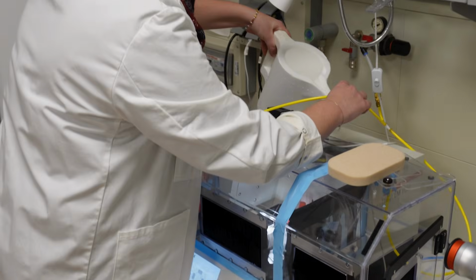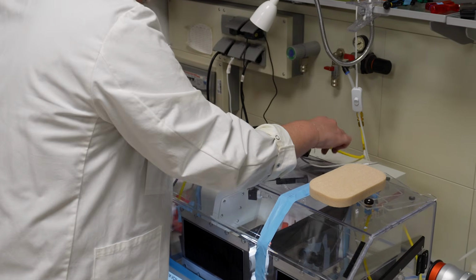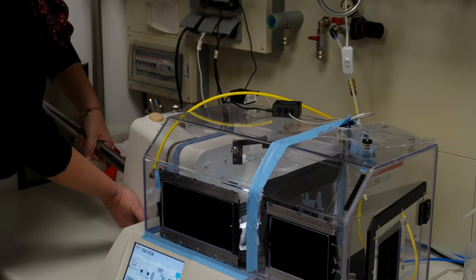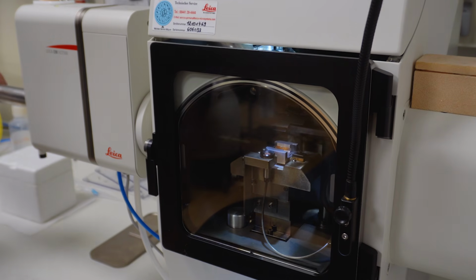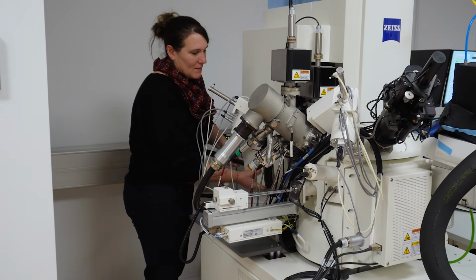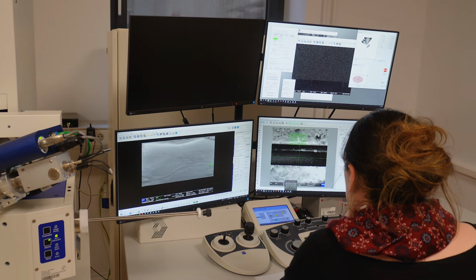In order to investigate the calcium transport logistics, I need to look at the precursors, and those precursors need to be maintained in conditions that are near native. So I need cryogenic workflows. All my images are acquired in cryo mode, which means the contrast is very reduced, and the artifact from the machine that I use, the focused ion beam scanning electron microscope, produces a curtaining effect. Those are vertical stripes that I need to remove in order to investigate my data set better.